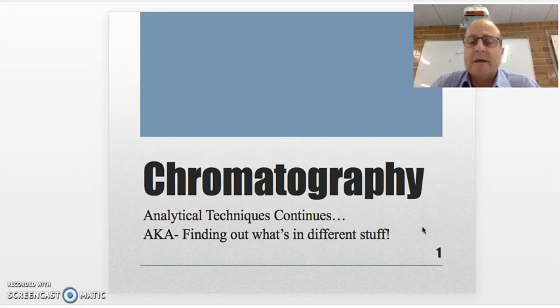Today we're going to be looking at a type of analytical technique called chromatography. This is the third of the types of analytical techniques that we will be studying in this course.